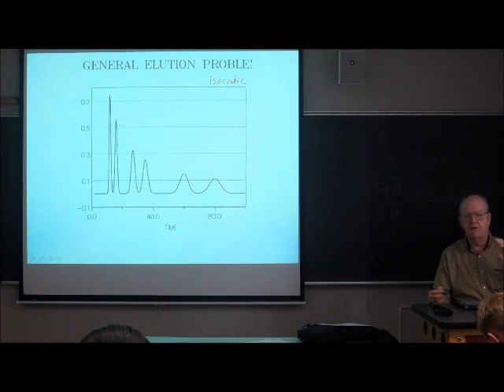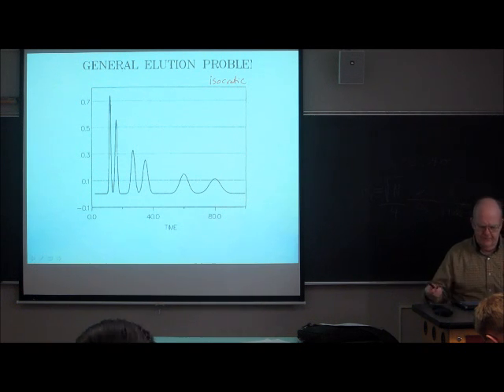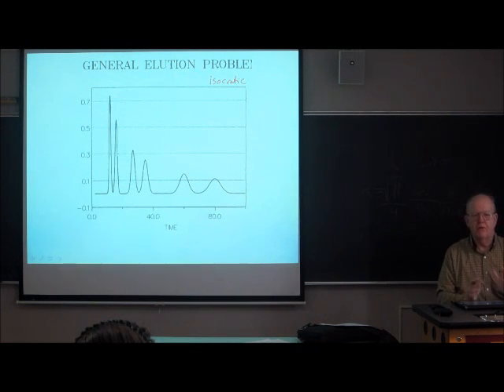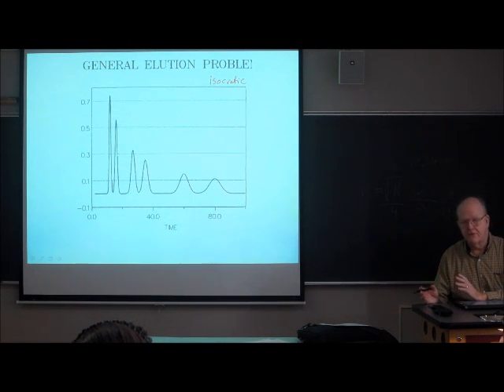We frequently run into the following situation. At a given temperature or a given composition, we find out that if you arrive at conditions which do a good job of separating the early peaks, that means that they're well resolved. The later peaks tend to be coming out really late and possibly too well separated with a lot of baseline between them.